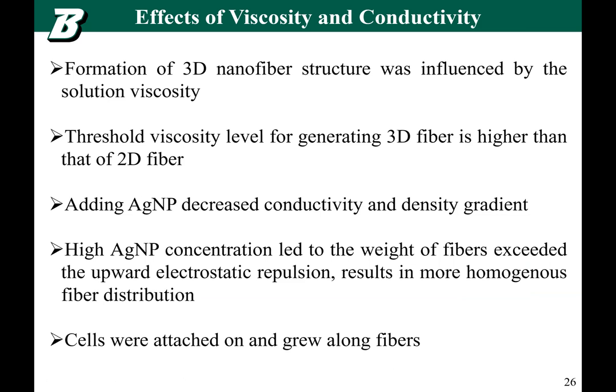And for the solution viscosity and conductivity measurement, we can see that the formation of 3D nanofiber structures was influenced by the solution viscosity. And there's a threshold viscosity level for generating 3D fibers. And that threshold is higher than for generating fibers in 2D space. And adding silver nanoparticle actually decreased conductivity and density gradient, surprisingly.